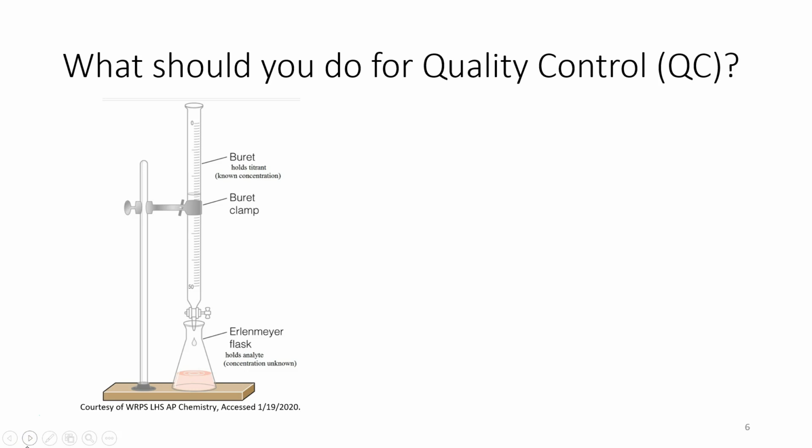And what are we going to do for quality control in this experiment? So again, is there something that we could titrate with a known calcium ion concentration? That would be a good thing to do for quality control. And that's exactly what we're going to do.